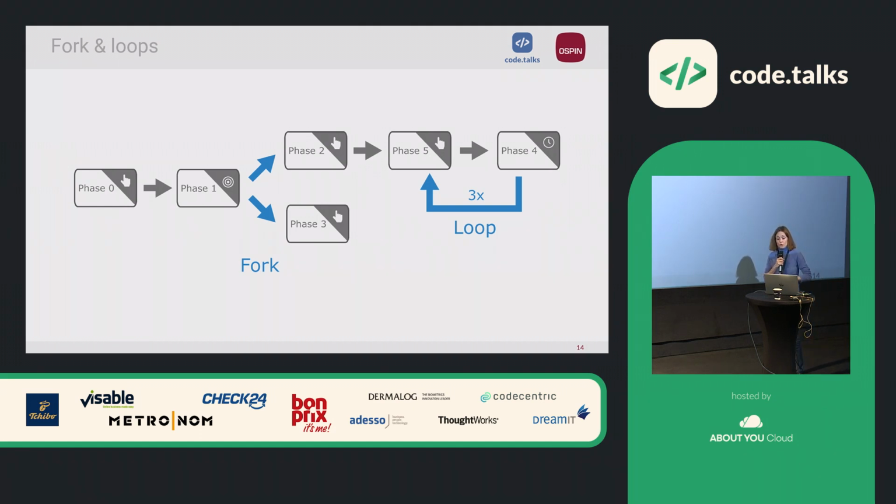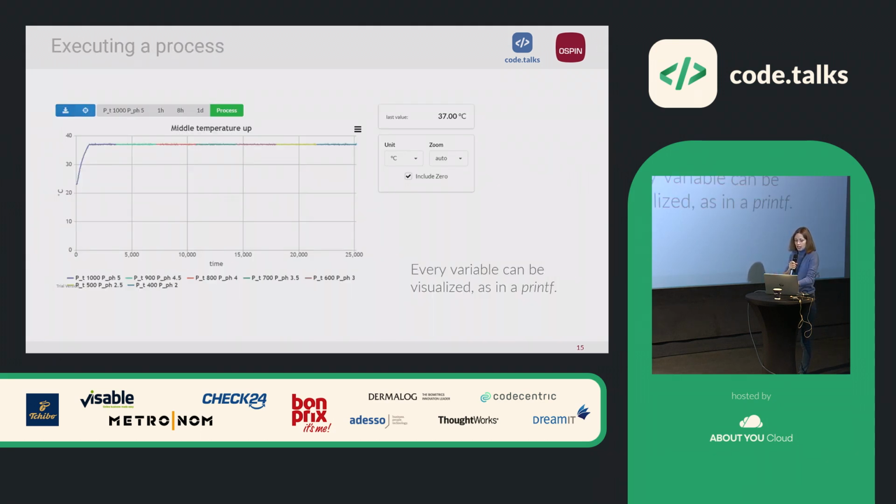And what we also want to introduce in our user interface is the ability to have loops, so that I can say this phase or this group of phases should run 3 times, 4 times, whatever, as a for loop that you usually use. And I really believe that when we reach this point, where we can set a variable, we have these code blocks, and then we have conditions, and we can fork the program execution or loop it, then it's basically a programming language for biologists in the context of our machine, of course. They can then program whatever bioprocess they basically want. And now we were talking about programming a process, and so the configurations that the machine runs.